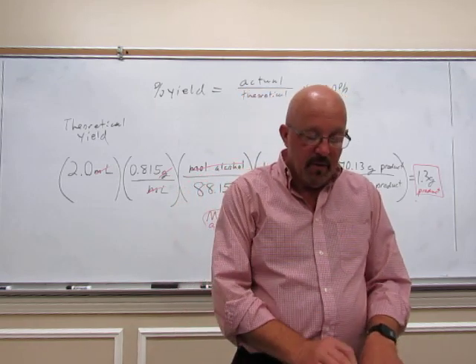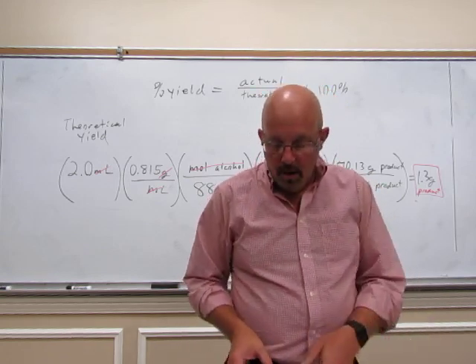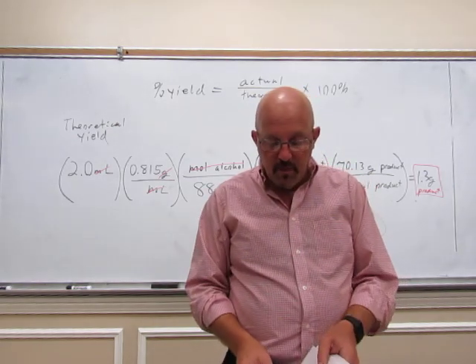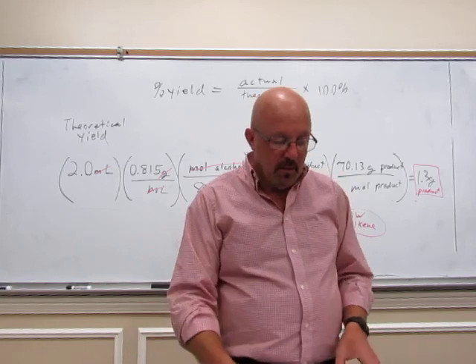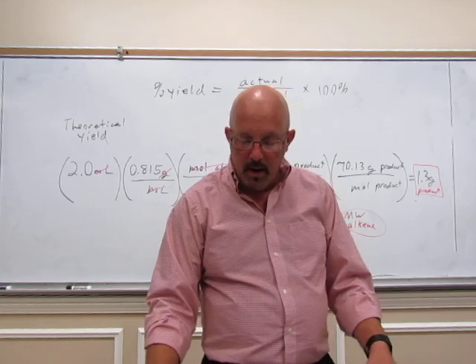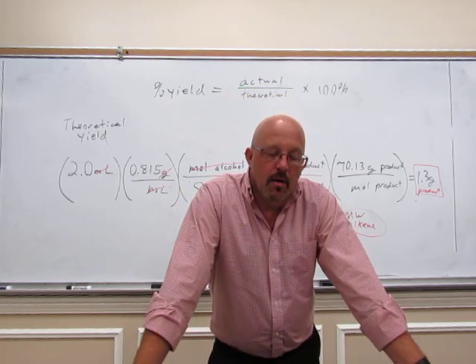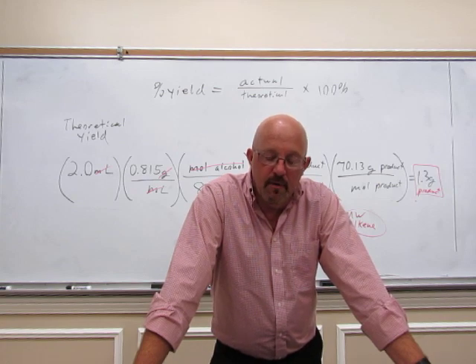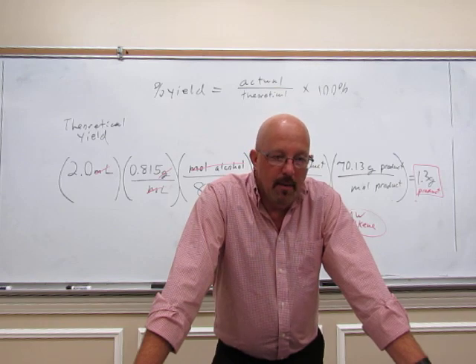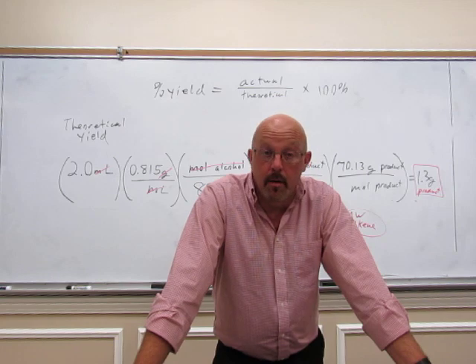You'll take a spectra of it and you will talk about that spectrum in your conclusions. I'm going to give you a spectrum of the starting material, the starting alcohol, and you'll have the spectrum of your product. And I want you to talk about how those IR spectra show that we converted the alcohol into the alkene. You can talk about peaks disappearing and or peaks appearing.